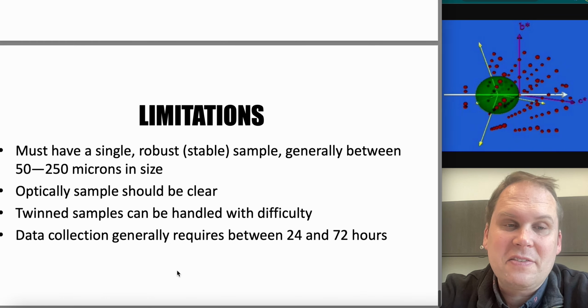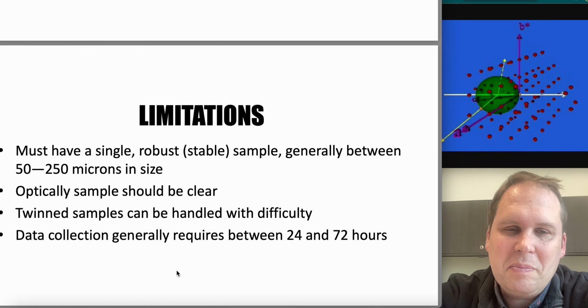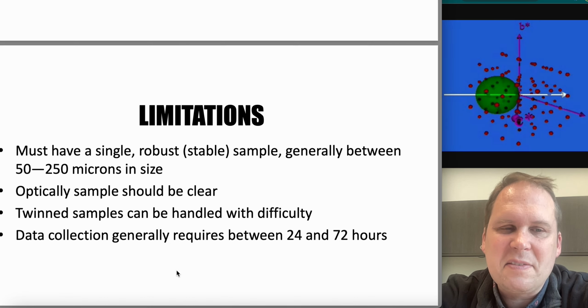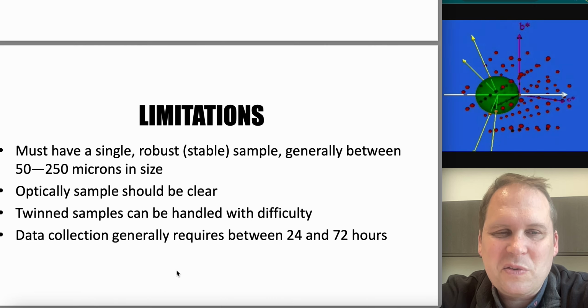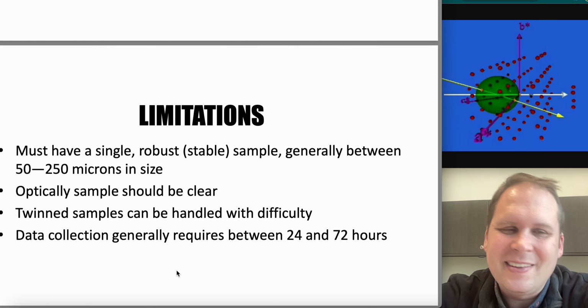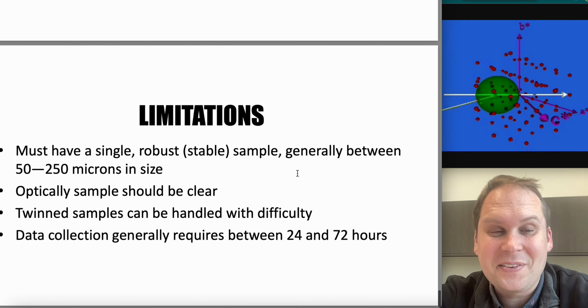And yeah, data collection often requires, you normally send up 2 or 3 people and they'll work in shifts over a couple of days to get as much beam time as possible for the travel and dollars and rental of the beam line. So there you go. That's how you do it efficiently. This has been X-ray crystallography.